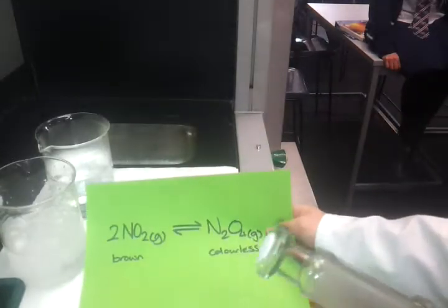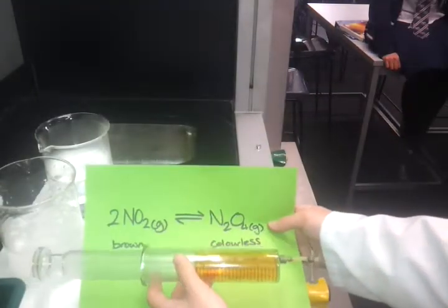Okay, I still have to talk over that fan for a wee while. So, once I make that gas, it can escape into the environment and that's it. It doesn't do anything else. But if I capture that gas and put it in a closed environment, something that it can't escape from, then we get an equilibrium occurring. And that's what we can see in this vial here.